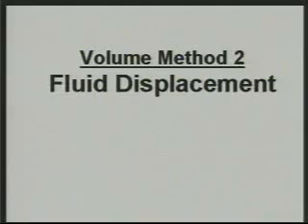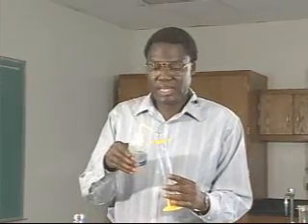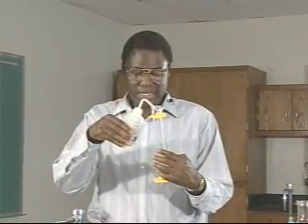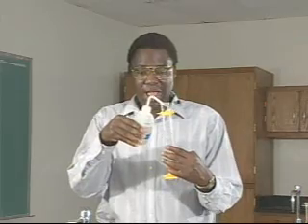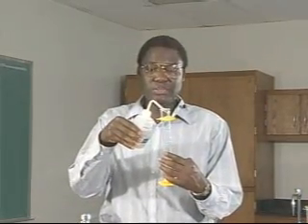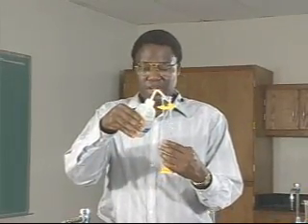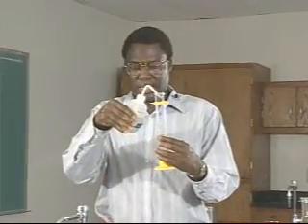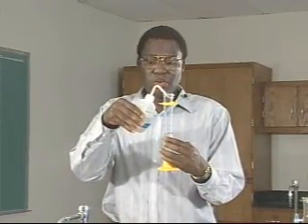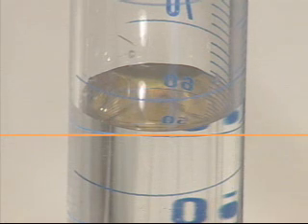Another way to obtain the volume is by the method of water displacement. Take a measuring cylinder and put in some water — about 60 to 70 milliliters. If you have less, your object won't be fully immersed; if you put too much, the water will overflow. Once the water is in, look at the surface — you'll notice it is curved, not flat. That curvature of the water's surface is what we call the meniscus.